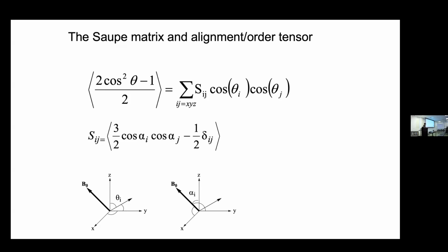It's a tiny shift. So it's not true that you should see no shifts. And so to be super careful and rigorous, what kind of nucleus would you like to compare? One that has a weak CSA anisotropy. Not something with a juicy CSA, because then it's going to have a bigger shift.